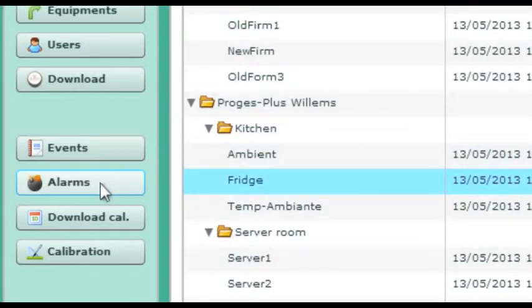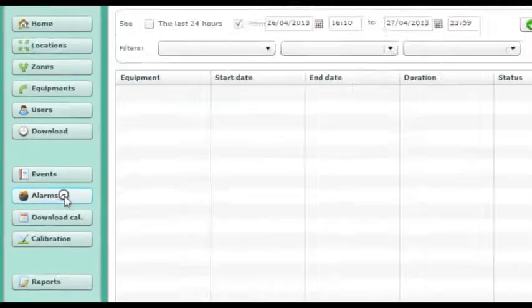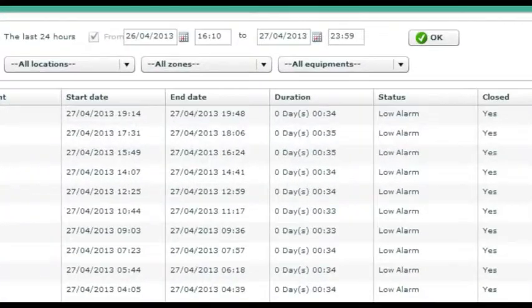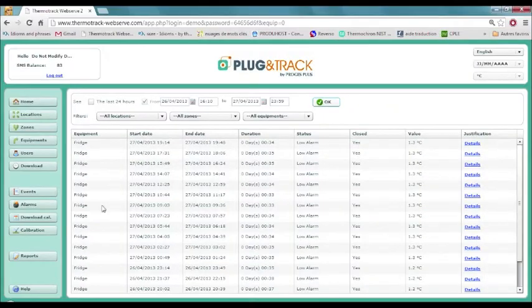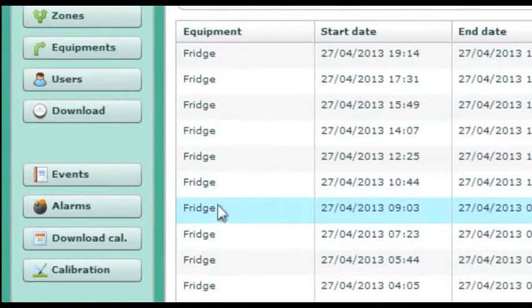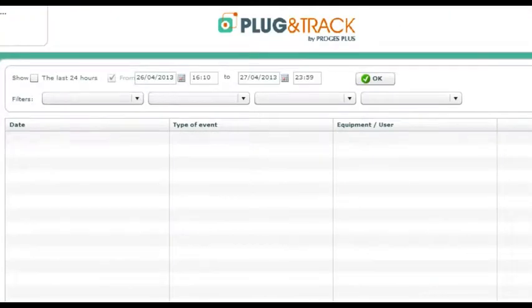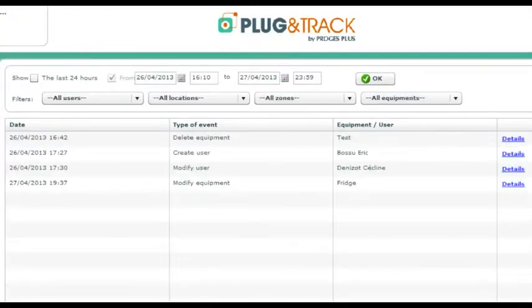From the home page, you can also check alarms of all probes at a glance. With the event list, you can control who has modified what.